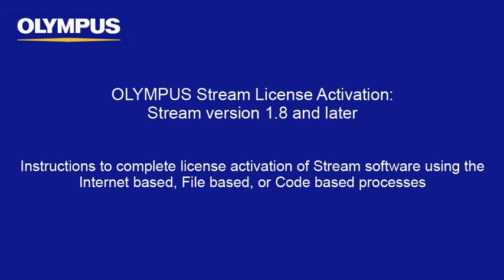This tutorial video will provide you with detailed instructions for activation of the Olympus Stream software license using the internet-based, file-based, or code-based processes.